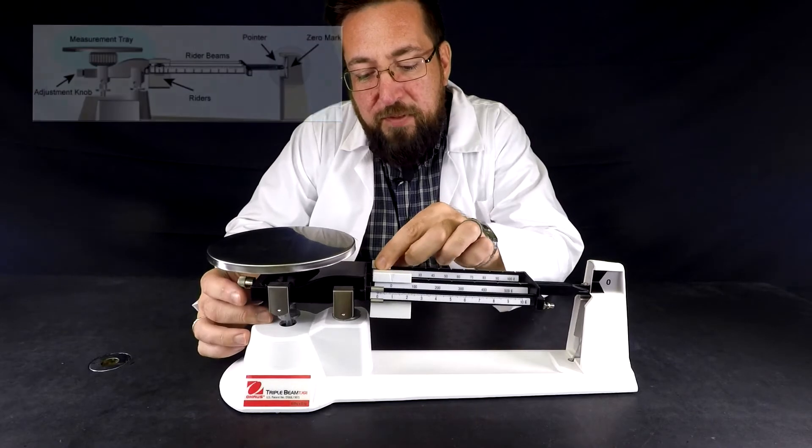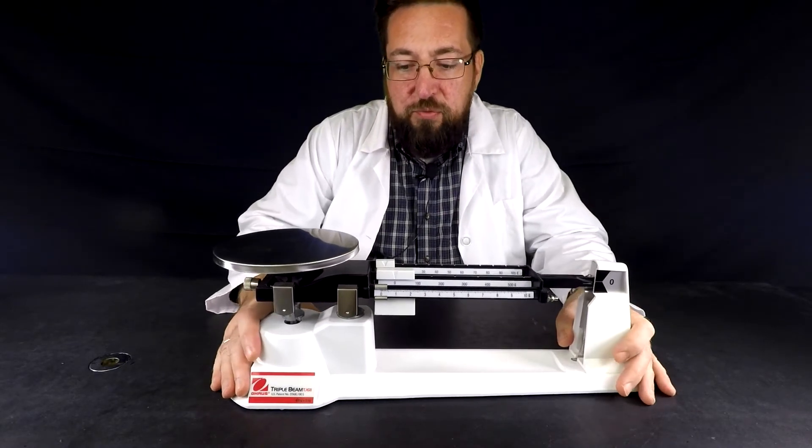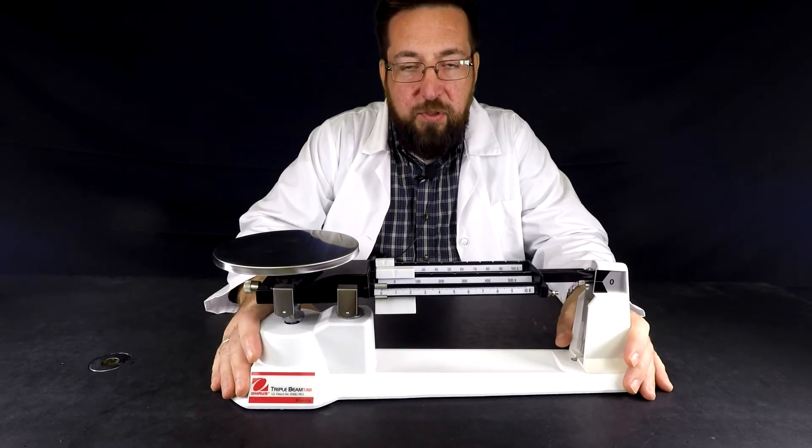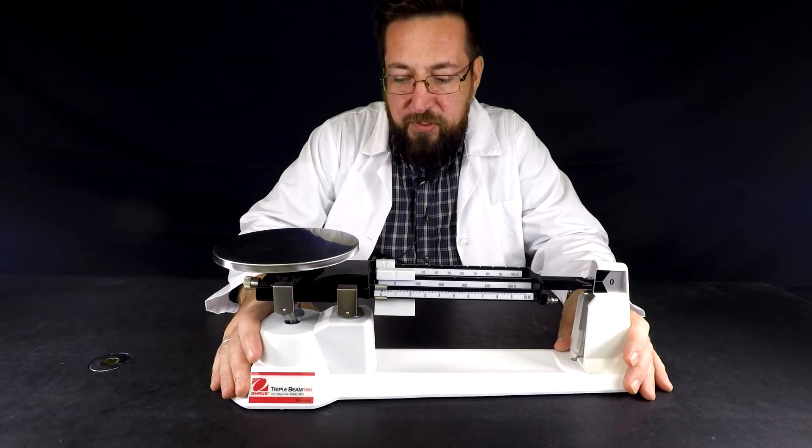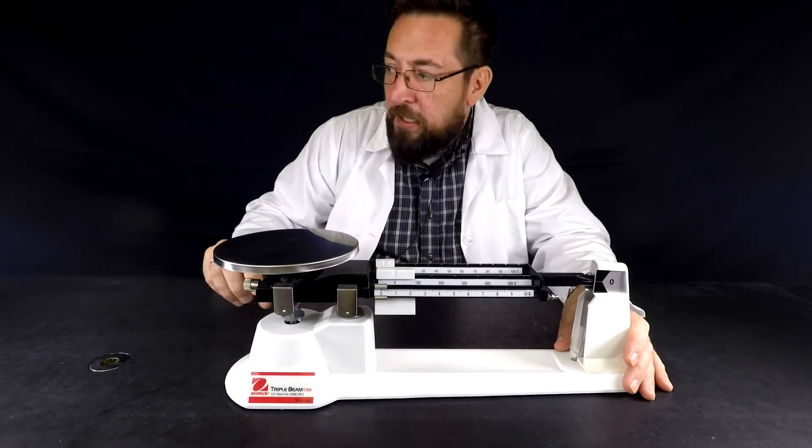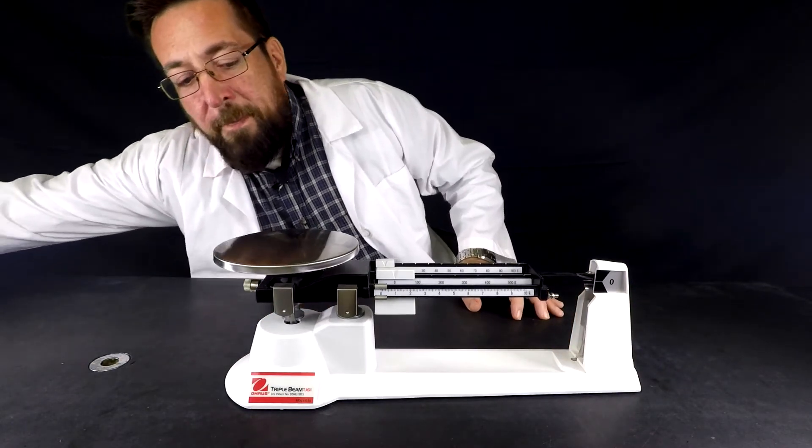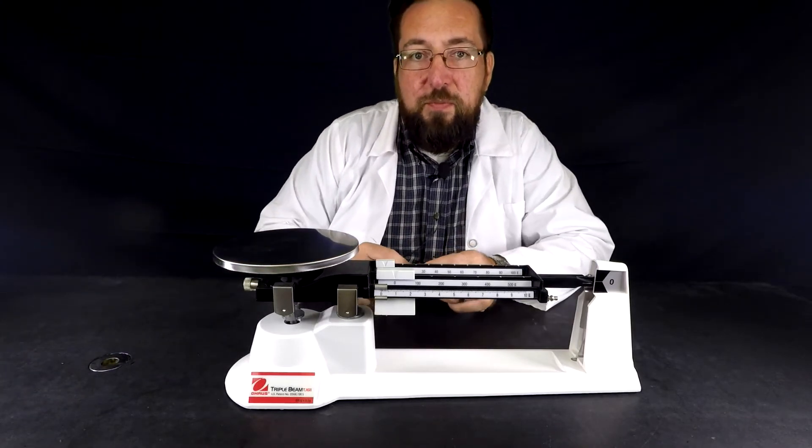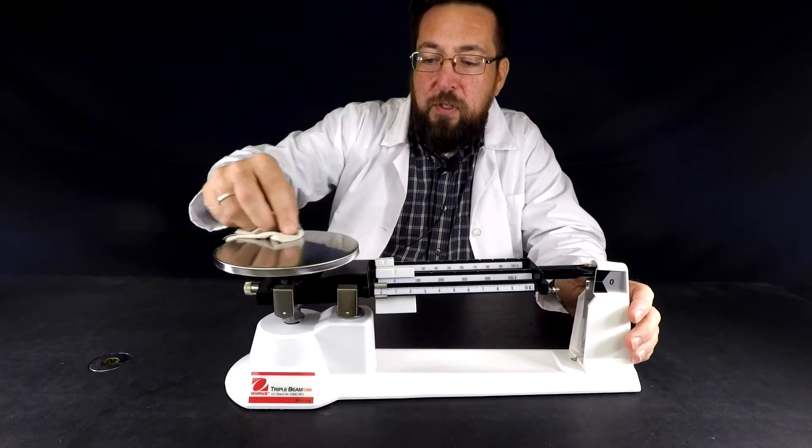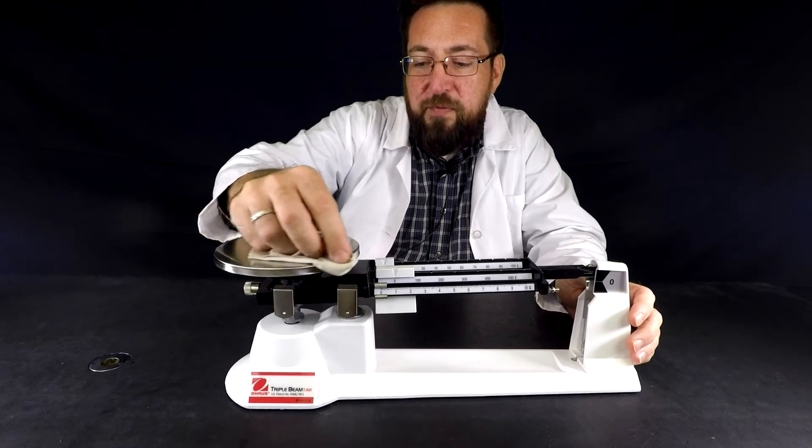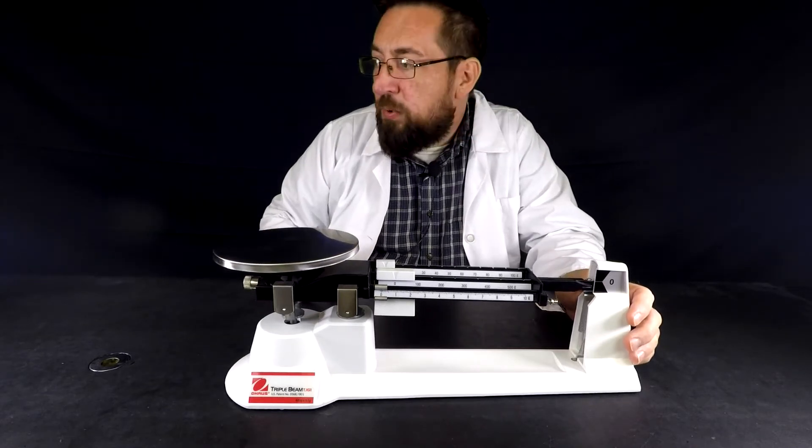So the first thing we have to do is make sure that your triple beam balance is set on a level surface. If you don't have a level surface you're not going to get a correct reading. Second, if this has been sitting in a classroom for a long time you want to dust it off because that tenth of a gram of dust may affect your reading and this is a very precise instrument.